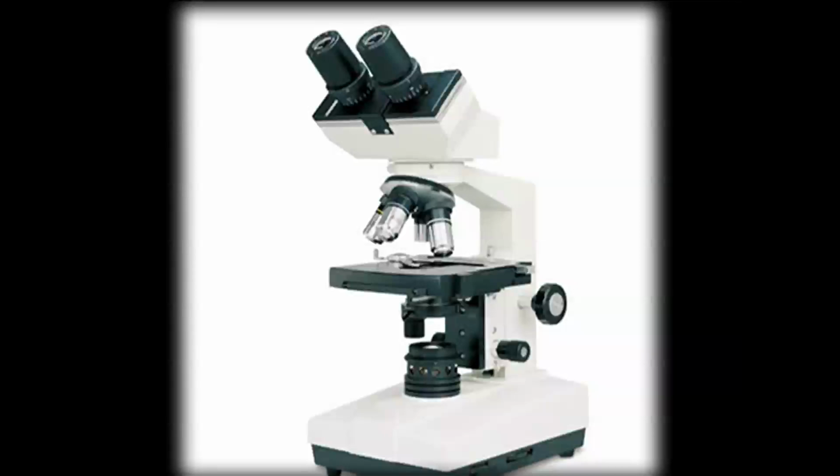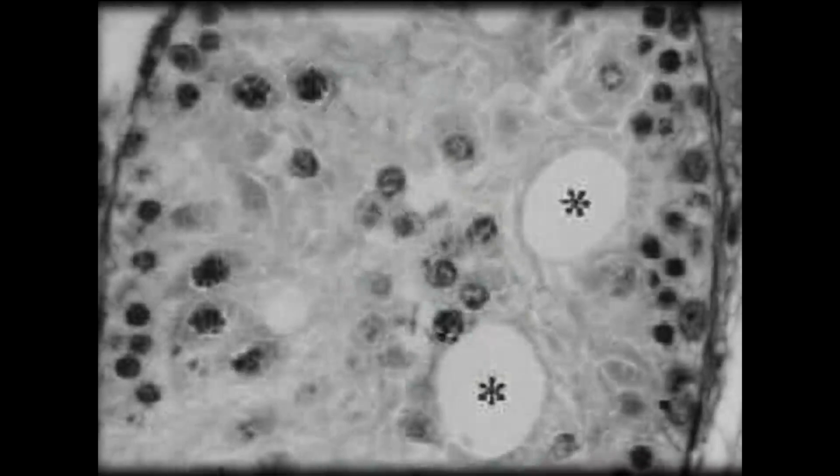The problem in light microscopy is too much light. Let's say I want to see events at the surface of the cell. If I just use a light microscope, the whole of the cell is lit up. If I use a microscope or a lens where I create the condition of total internal reflection, then only the part of the cell which is near the plasma membrane will get lit up. I will come to the details in a later section of this lecture.